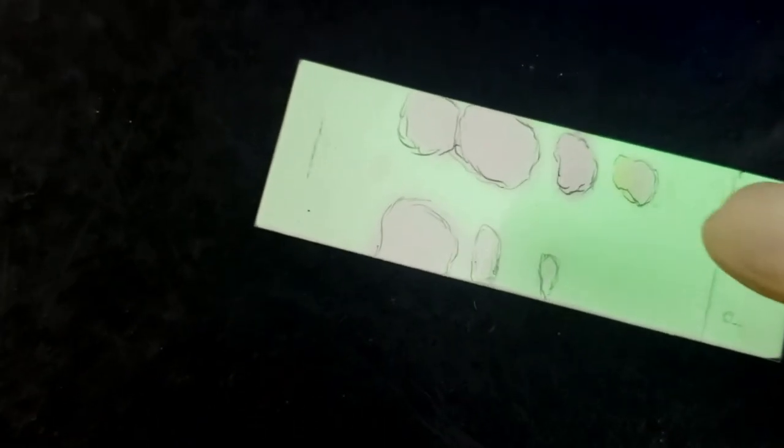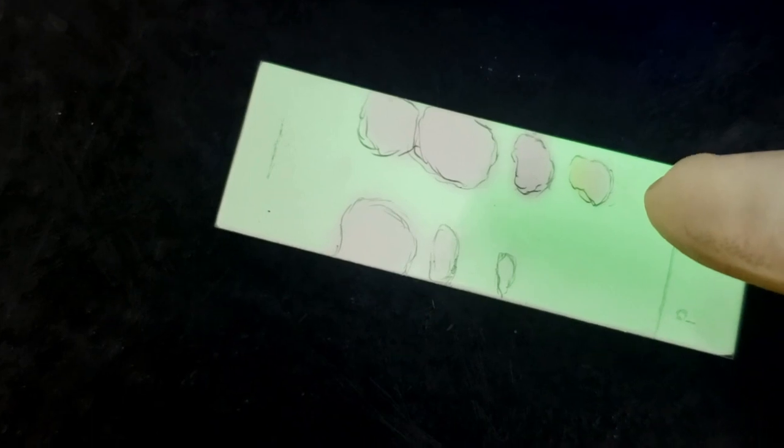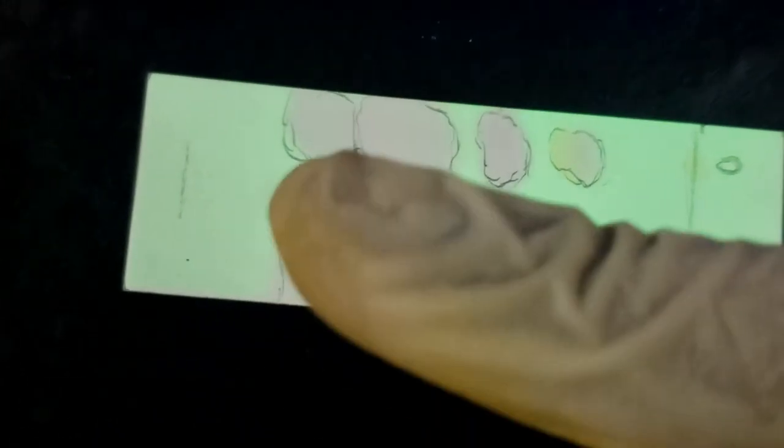So this spot right here is the 1-bromo-2,4-dinitrobenzene. This side is for the P-bromonitrobenzene. This side is for the O-bromonitrobenzene. You can still see the initial spots where we started. And the line at the top is where we ended.